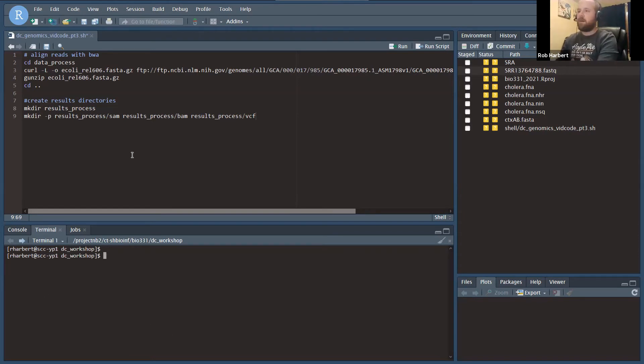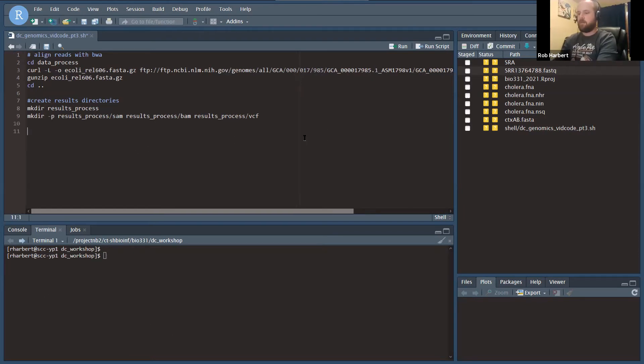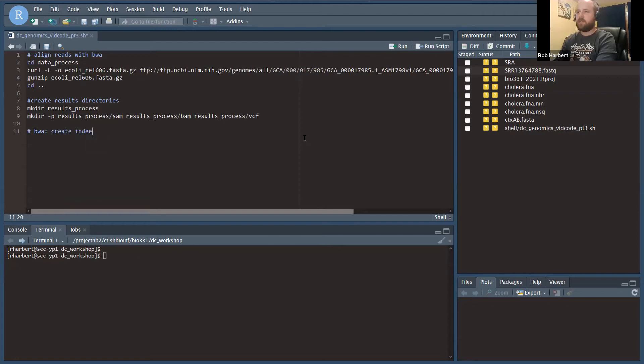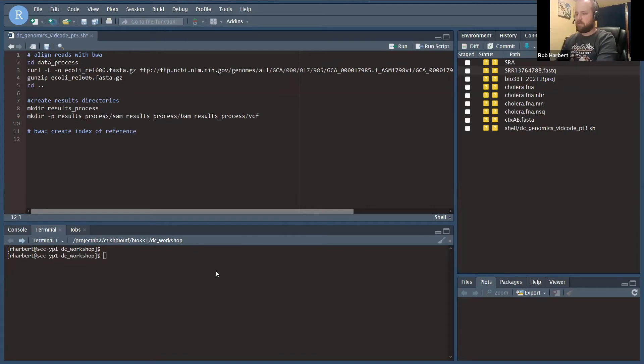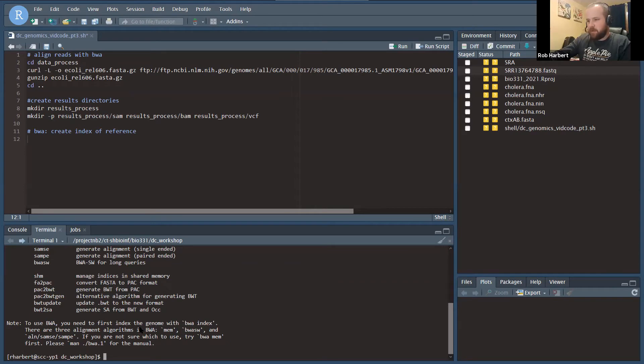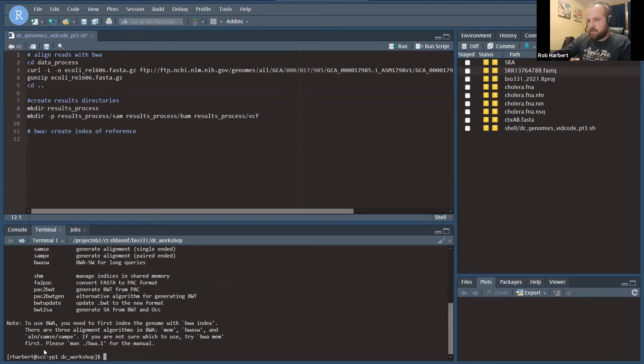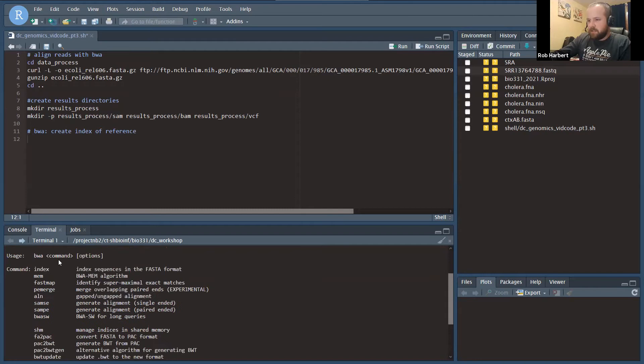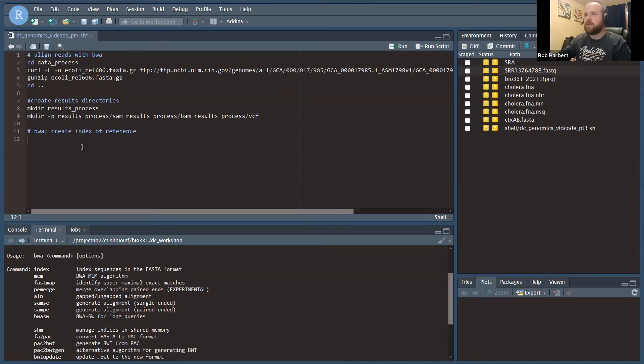Now on to BWA. The first thing we have to do is create an index of our reference, and for that we'll use one of these BWA modules. If we type BWA at the command line, it shows some information about the program. It says to use BWA you need to first index the genome with BWA index, and then there are three alignment algorithms: MEM, BWA-SW, and aln SAMSE and SAMPE. BWA MEM is the typical aligner, but we need to use the module index first.